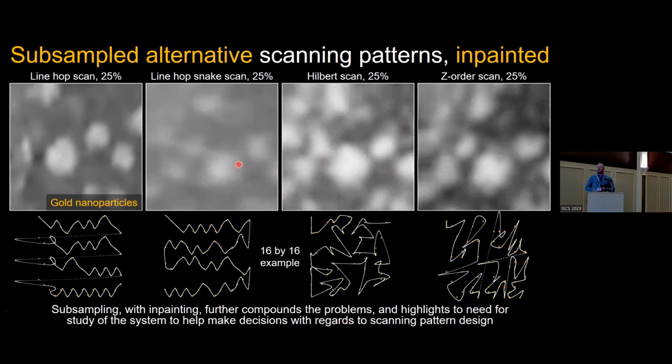But we can look at other subsample scans. So here's the other 4. We've got the modified raster scan, modified raster with a snake variant, and then subsampled Hilbert. So this is just by doing a coin flip to say whether or not a pixel in the Hilbert curve should be included. Same for the Z order. And yeah, we get interesting results.